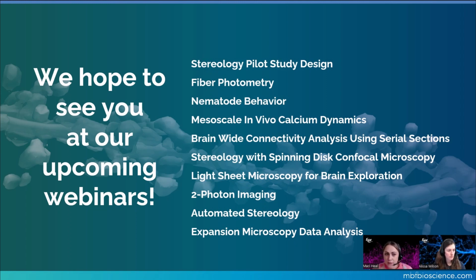So that batch pipeline, we have a webinar that we put out last year about all of those tools. So I definitely recommend giving that a listen or contacting us, but that goes through the steps to get there. And the nice part about it is that you can run those filters across many images at once in that batch filter. Or you can use it to find the correct settings for your images. There's a few different settings for each of the filters that you can adjust for your specific data.